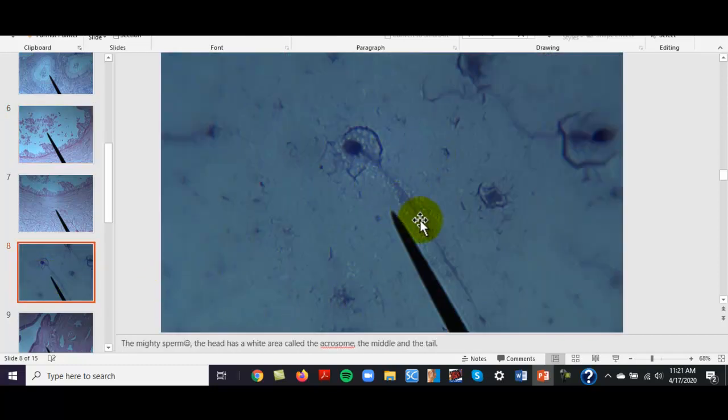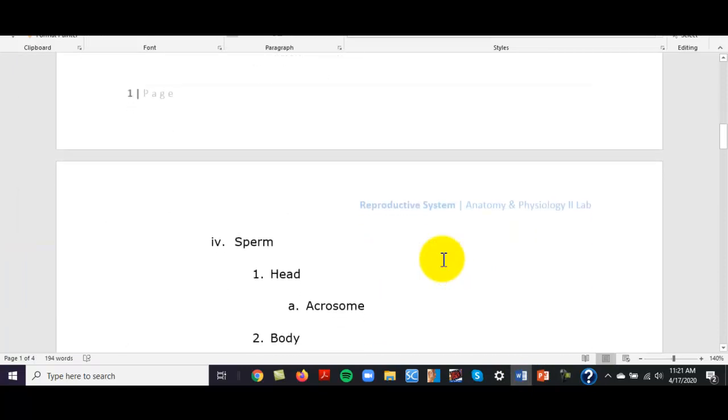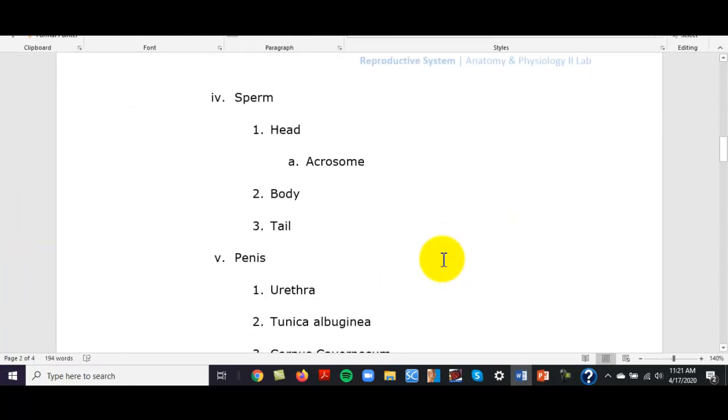All right, these are sperm. This is the tail. You can't really see it. There's a head, which is the round part, and then their mid-piece are the body, and then the tail. And sperm have on the very tips a part called the acrosome, which is a lighter area that has digestive enzymes, and that actually helps when a sperm comes in contact with an egg. It helps break down the outer layer of cells around the egg.